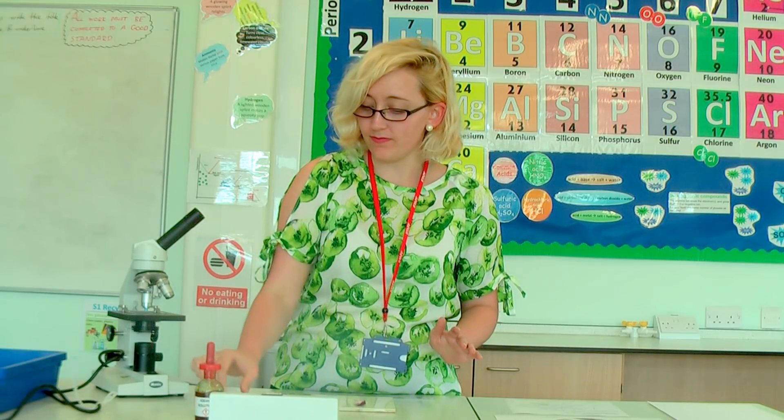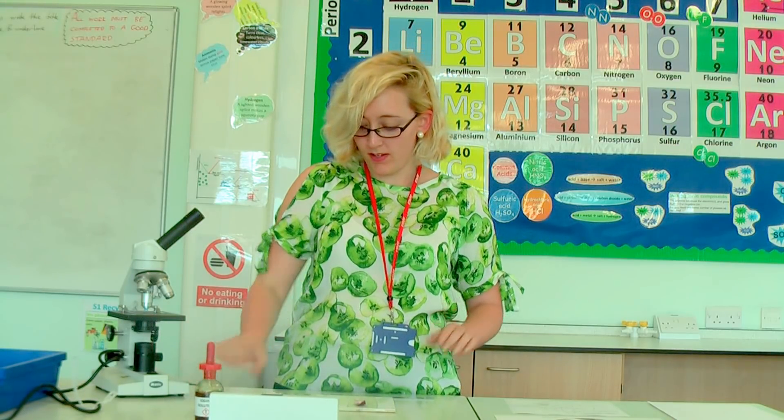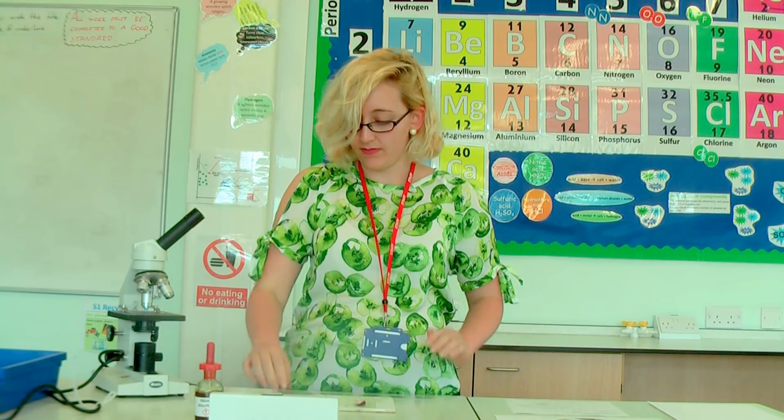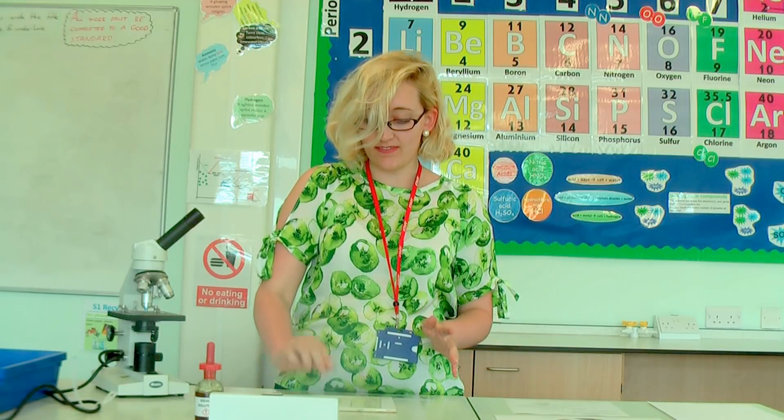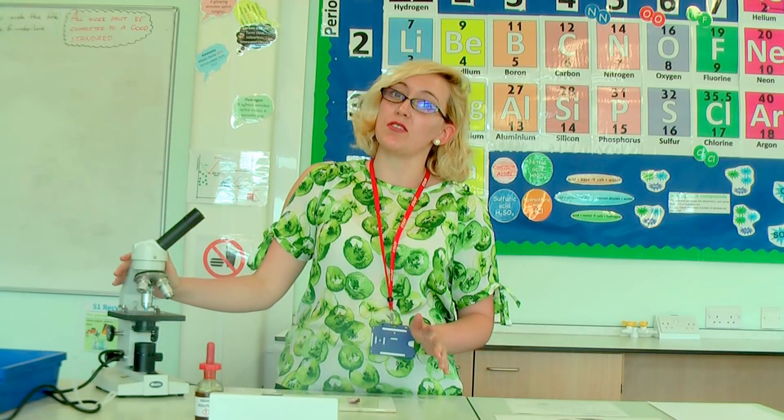Good afternoon everyone. Today we're going to be doing the AQA biology required practical on microscopy, which is making onion cell slides. The equipment you'll need today is a bottle of iodine solution, a glass slide, a cover slip, a perspex ruler with millimetres on it, forceps or tweezers, a scalpel, a white tile, and obviously an onion.